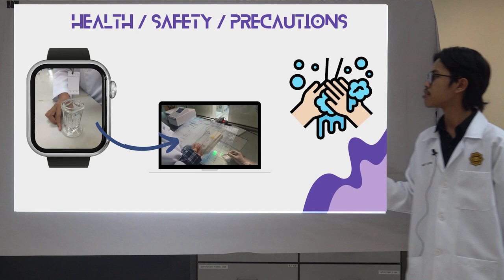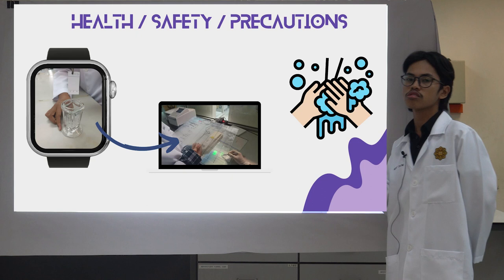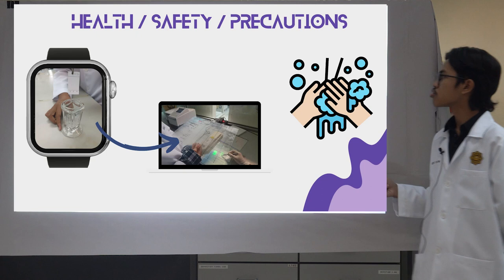The most crucial part here is when we handle the TLC plate, we are using shortwave UV light. When you handle this, do not handle it too much, because excessive exposure can lead to skin cancer or damage your eyes. So we are moving to the next part.